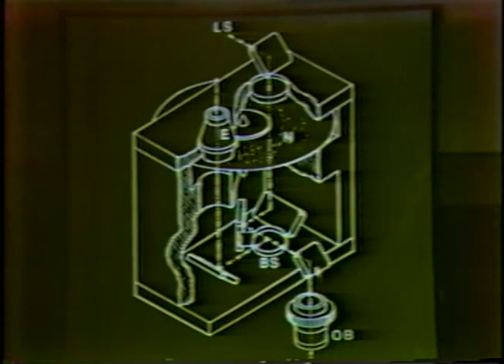the objective. And the only purpose of this particular mirror here is to make the objective point downwards, since the essential concept of this microscope is that one will be using immersion lenses to look at live specimens, and so they're going to be water immersion lenses, and water runs under gravity, so the objective must be upright. Otherwise it could stick out in this direction here.